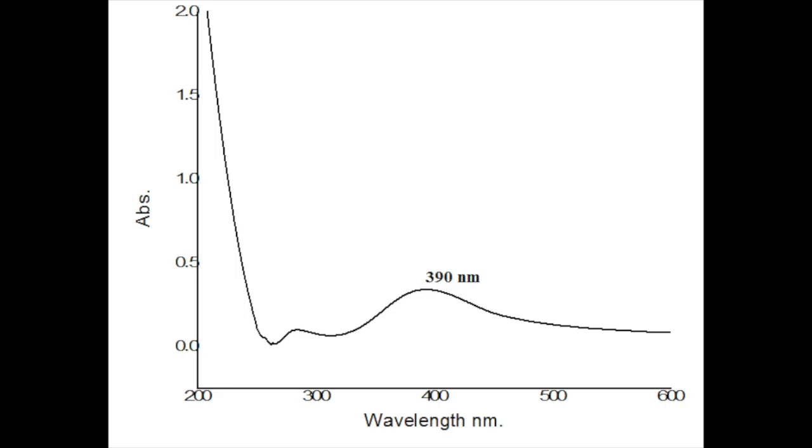So in this lab, before we measure the absorbances of all the dilutions, we first have to take the stock solution and scan it across all wavelengths. By doing so, we can find out two things. Both of them are different in the way they are measured. One is qualitatively and the other one is quantitatively. So the first one is qualitative evidence.